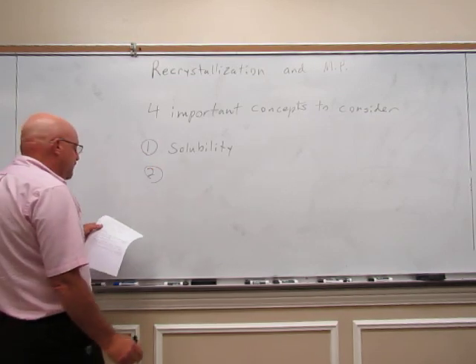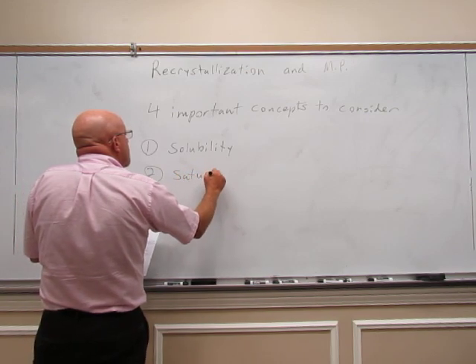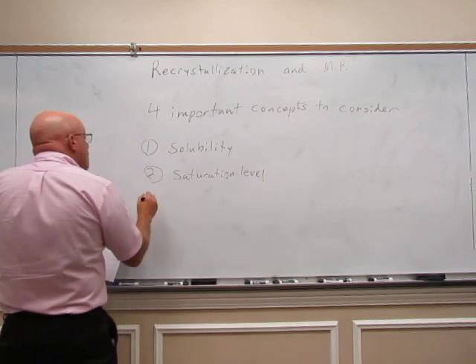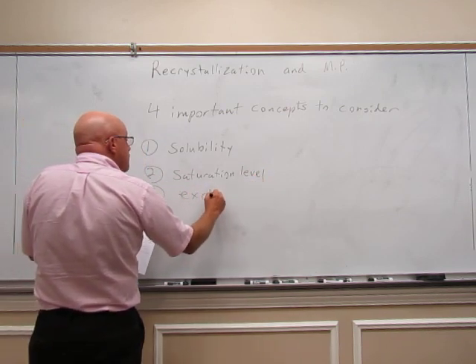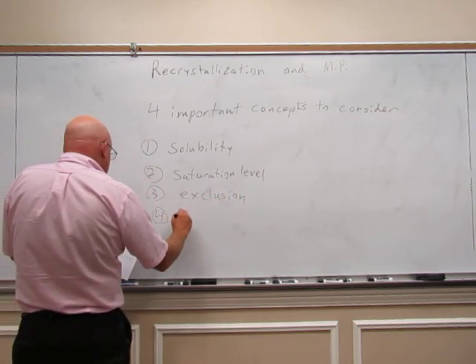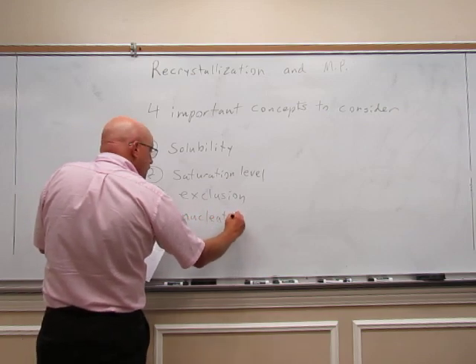Another important concept is saturation level. Next is exclusion. And finally, nucleation. Now I'm going to discuss each of these separately.